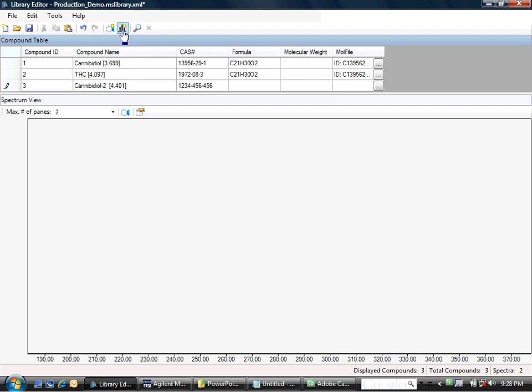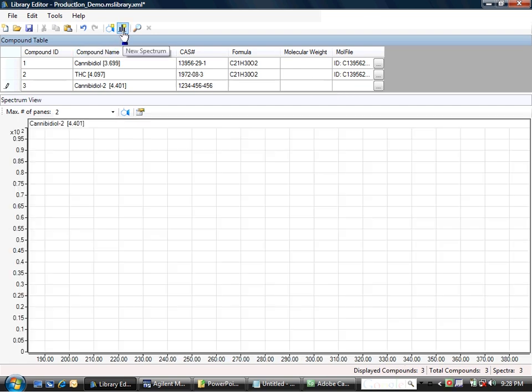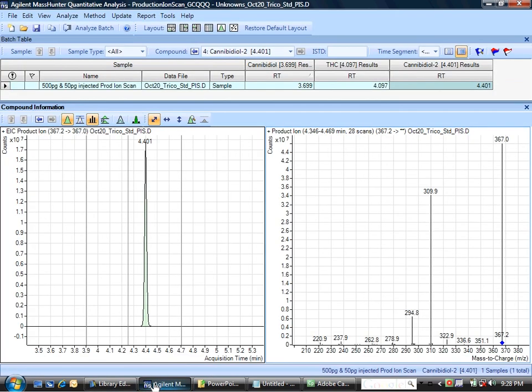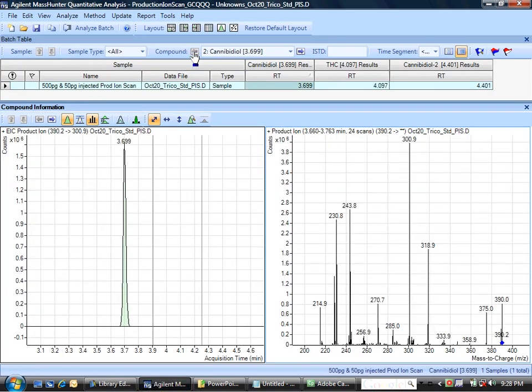So I will go up here to the new spectrum and say add a new spectrum. It's blank, of course. So I need to go over to either Qual, or in this case, I'll go over to Quant. And here are the compounds that were already existing.